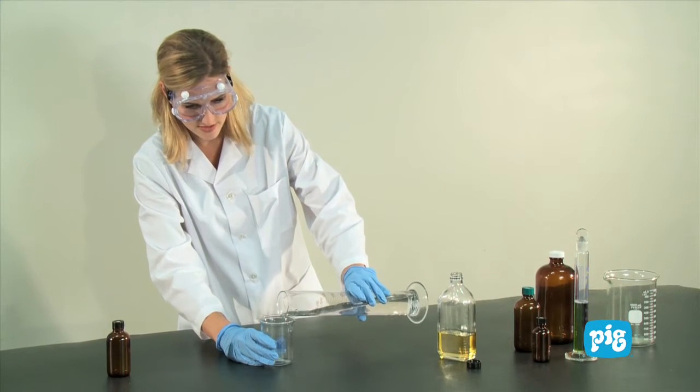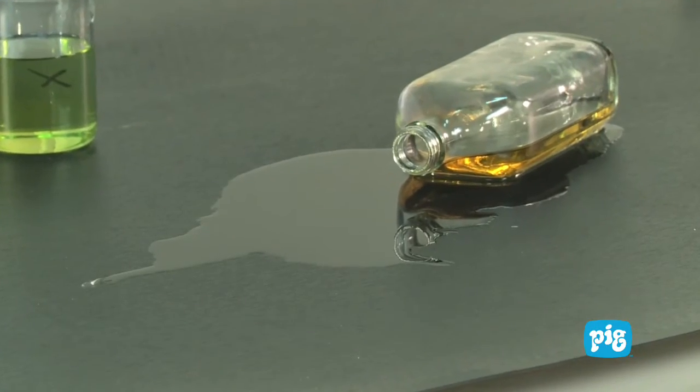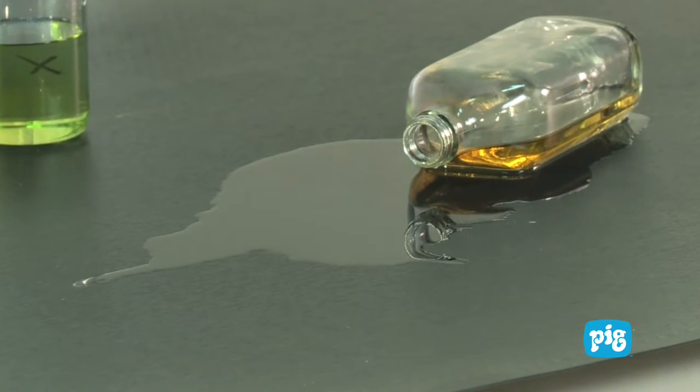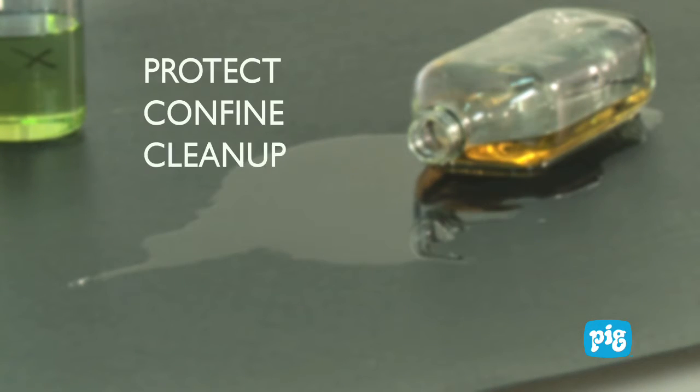Everyone tries to be careful, but accidents can still happen. When a spill happens, it is important to follow these essential spill response steps: Protect, confine, clean up, and dispose.